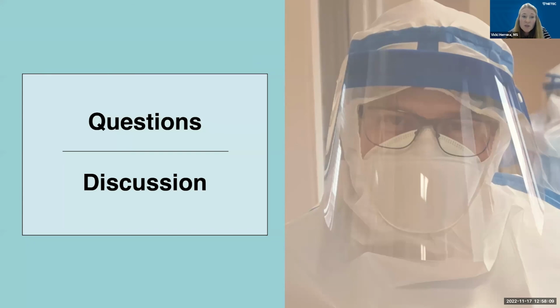So it is an option. Again, you just have to walk through what that means for being in the room with the patient, and making sure that you have possibly another person, whether that's the nurse in the room, just available in case you need something. We still recommend that second person.